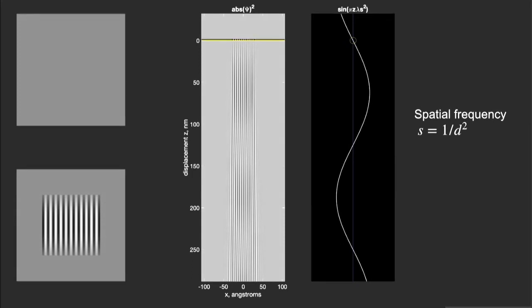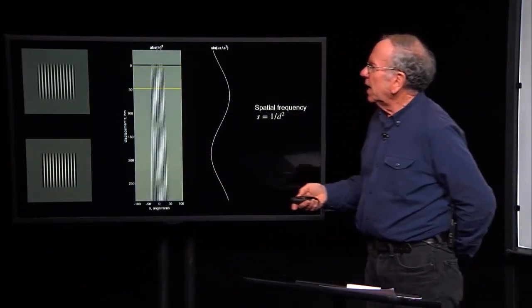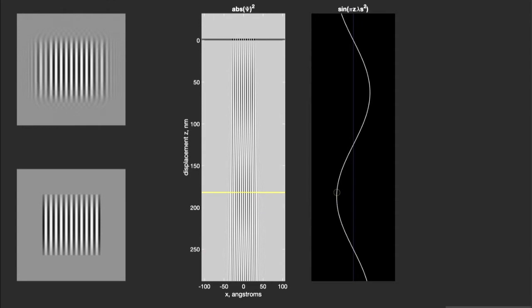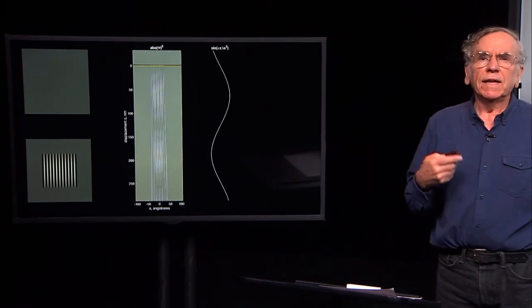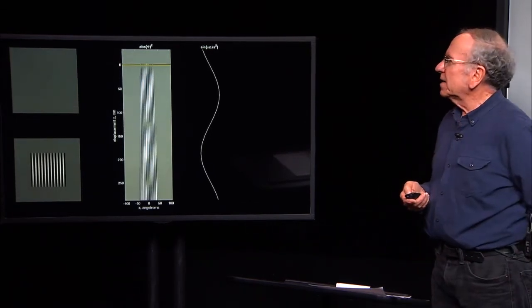This is where we get contrast transfer by defocusing the microscope. So what I'm going to imagine is I'm going to focus the microscope at different distances below the specimen. And as I do, the image that I get becomes stronger in contrast, and it's actually in one polarity and the other. So if I now go backwards, you can see it again. We go through a null here. Here we have high contrast, and then there's a null there again. There's no contrast when we're focused exactly on the specimen because there's no change in intensity. Under the specimen, all we have is a phase variation.